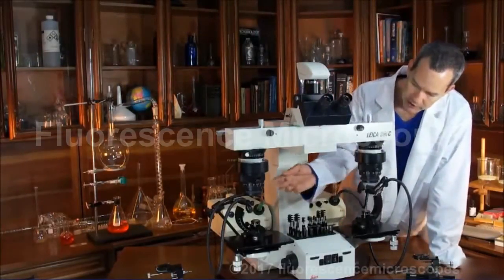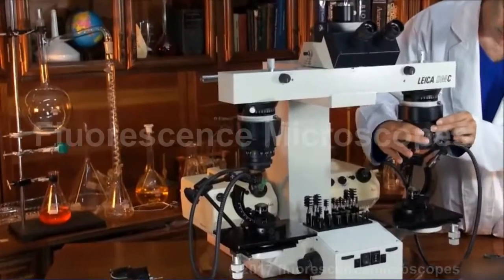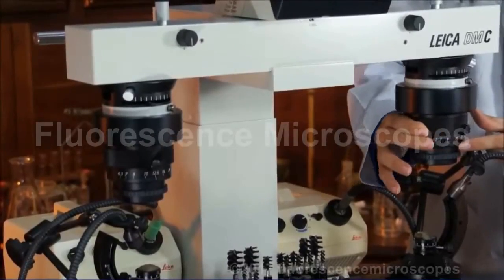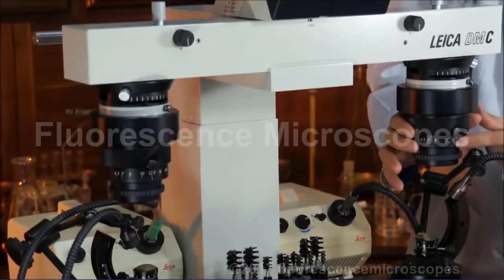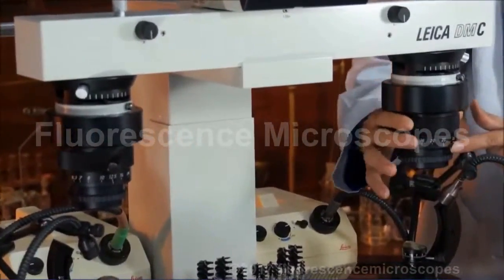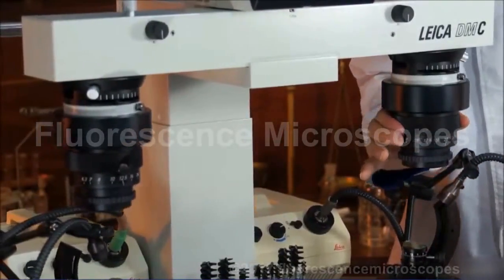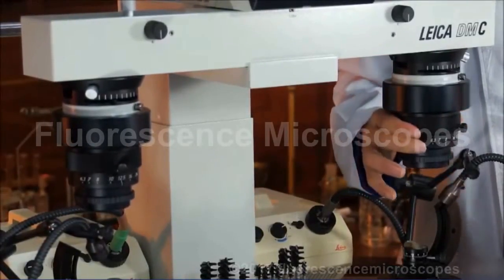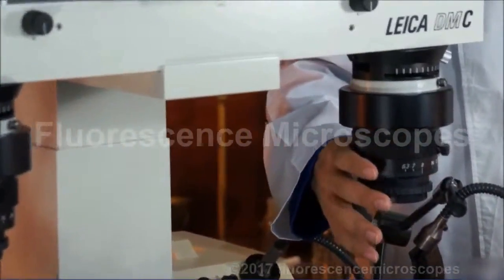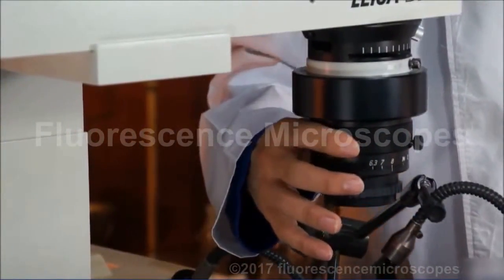These are low power objective lenses — they're zoom. They go from 6.3, with settings at 7, 8, 10. There's a click stop on some of them, like 12.5 is a click stop, then 16, 20, 25, and 32. So these are continuous magnification zoom optics, unlike the other barrel type objective lenses which give you a fixed magnification and you have to turn them to different settings.